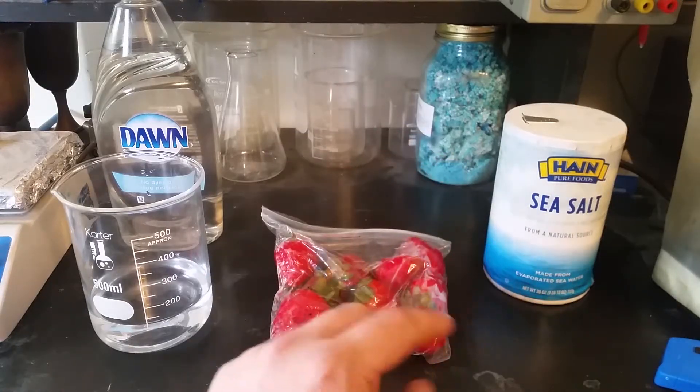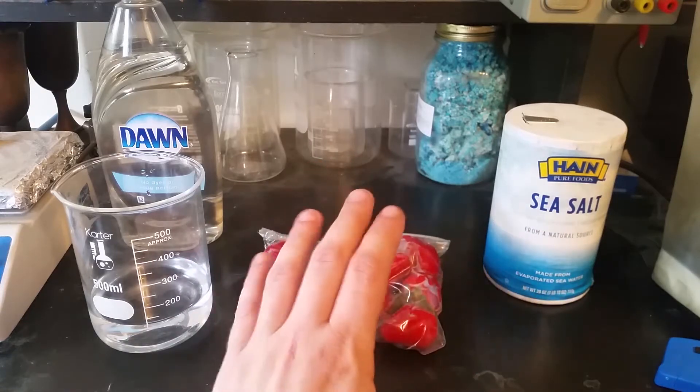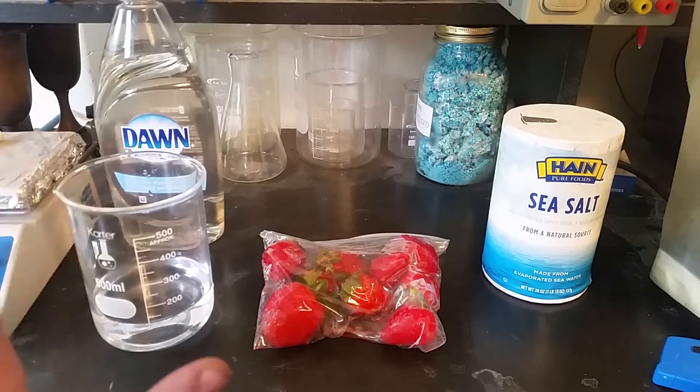I have the isopropyl alcohol in the freezer at the moment. I just got a bottle of 91%. In the video he used 99%, but I don't think that a little bit of extra water is going to kill us considering that we've got about 120 ml of water that we're going to be adding anyway.